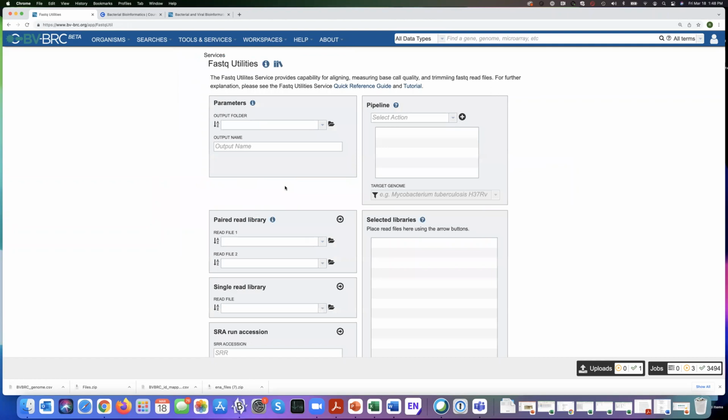Let me point out that I've been using the align function a lot, especially if I have messy genomes, or metagenomic samples, and especially for RNA-seq, where I'm trying to get a better assembly when I know that it's a mixed one and I will map it to something.